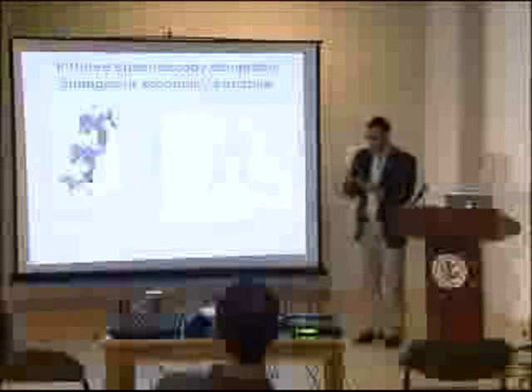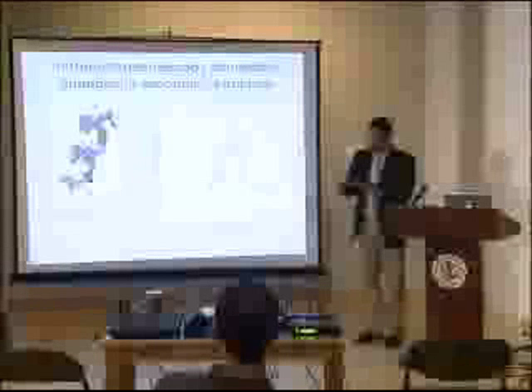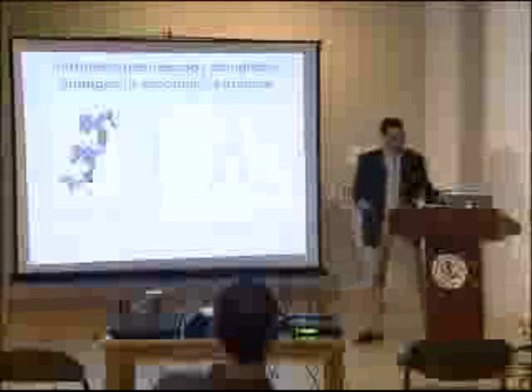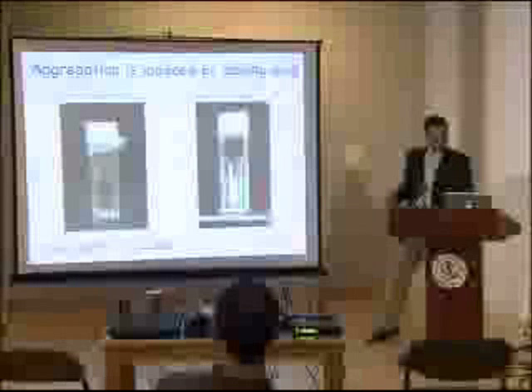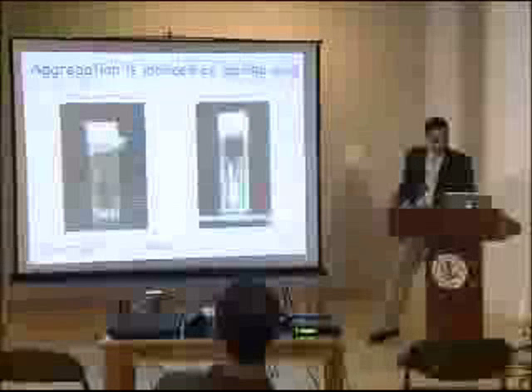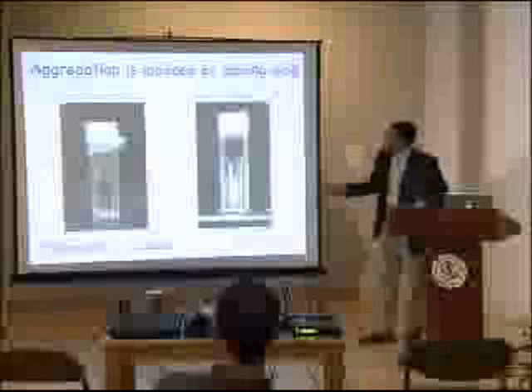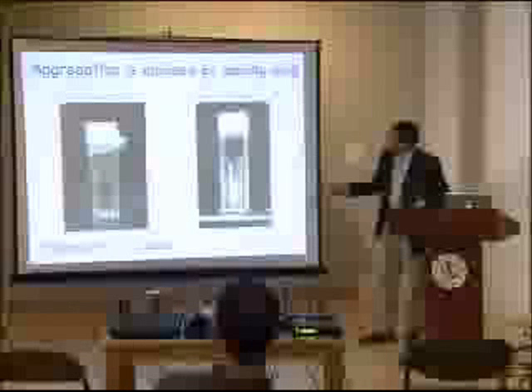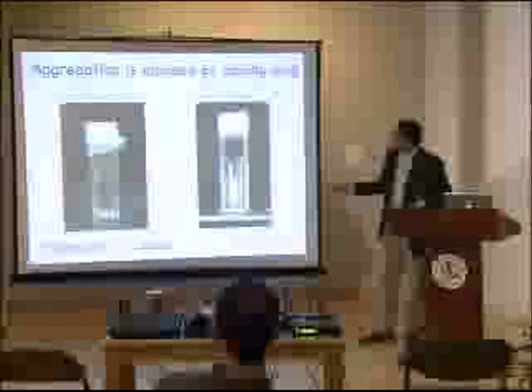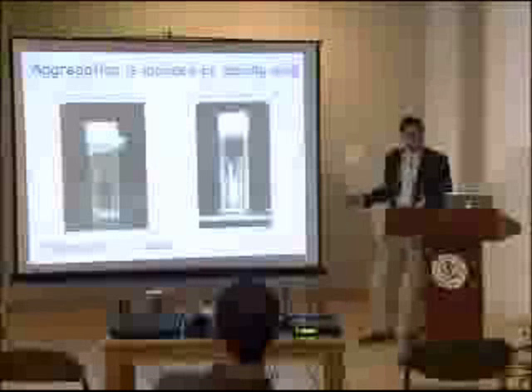So we now have a technique to isolate the proteins, to generate aggregation, to measure their structure. Now let's actually make some measurements. So, whoops, let me go back a step. So here's the clear, here's the aggregated. What we want to do is to start with the protein in its native state and then follow the changes as it goes to its aggregated state and look at the changes in structure over time.